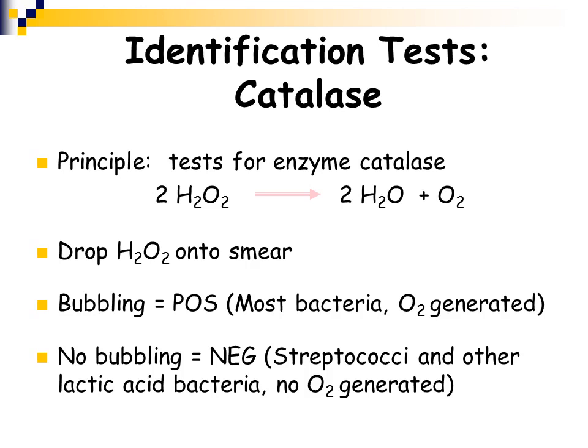Catalase is a test where you take hydrogen peroxide, you drop it on a colony, and if it bubbles up, it means the hydrogen peroxide is getting converted to water and oxygen causing these bubbles. If you get a bubbling, then it means it's catalase positive. So for your gram-positive cocci, that's a key, because if it's catalase positive, you're automatically thinking a Staphylococcus and not a Streptococcus.